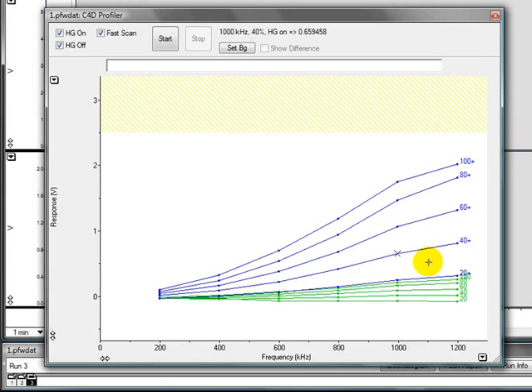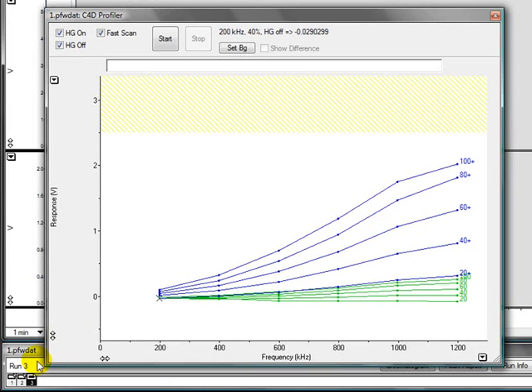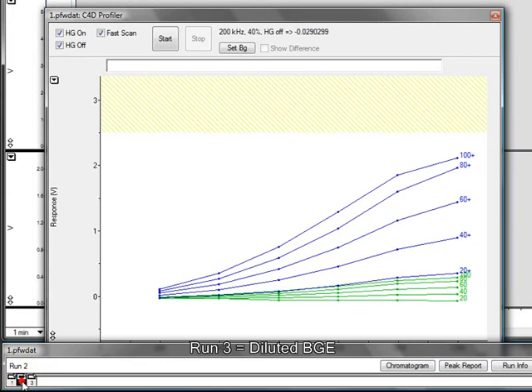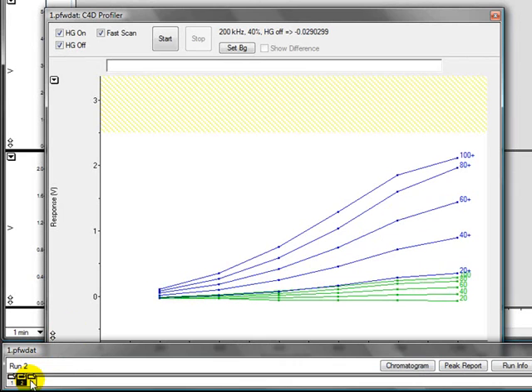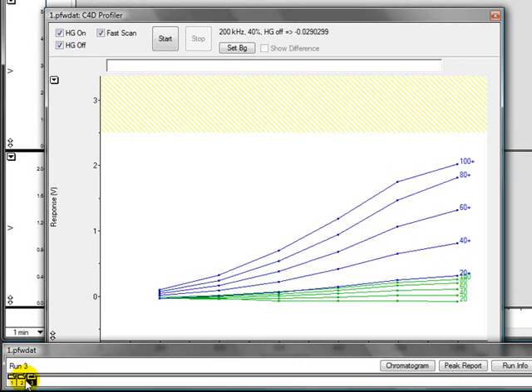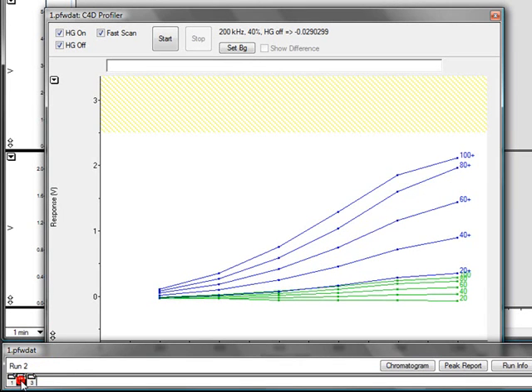When the software is finished, you will have another series of plots and you can compare those by clicking in the tabs down here. Tab number 3 is the diluted background electrolyte, tab number 2 is the undiluted background electrolyte. If I click between them, you can see they are very similar.